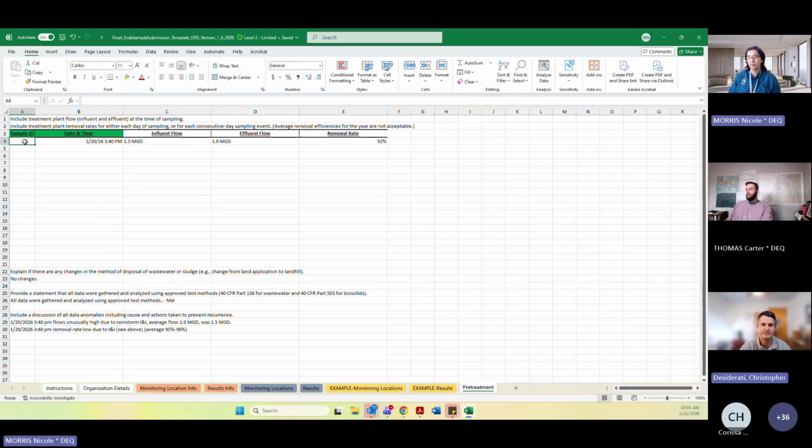Okay, cool. I put the sample ID in there just now, because I thought it could be helpful. But previously I was going to link it because it'll be the exact date and time. But if that won't make it specific enough, add a sample ID. You can even make up a unique one. No, that helps. Thank you.